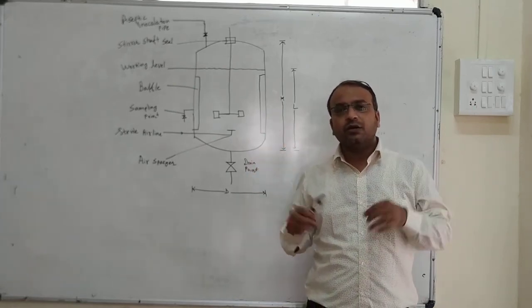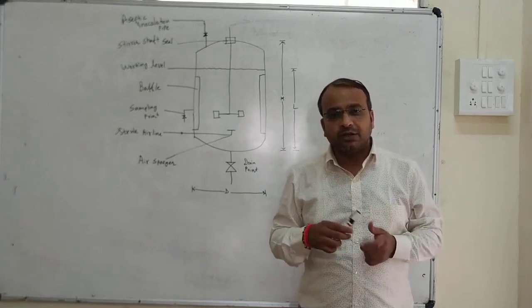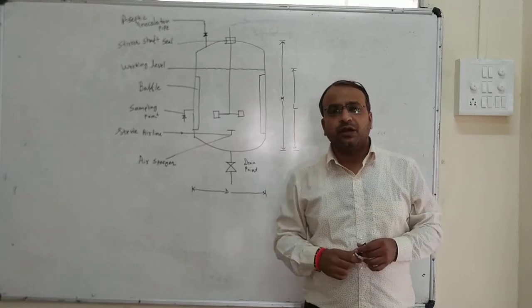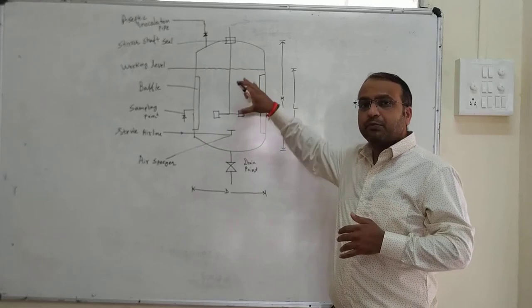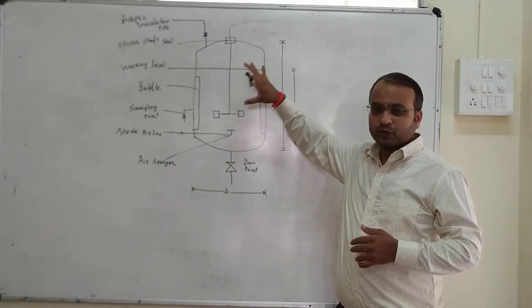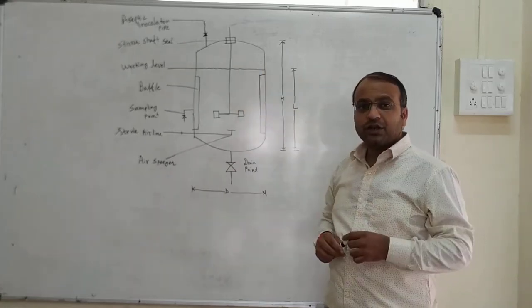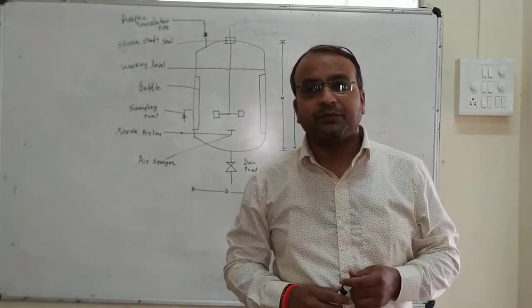That's why generally bioreactor is used as a terminology, so that it will cover all the microbiological processes which are processed in a particular reactor, or you can say a container. So this container is called a bioreactor. Bioreactor is a proper terminology for explaining this particular kind of reactor.